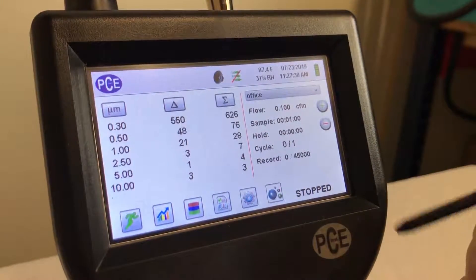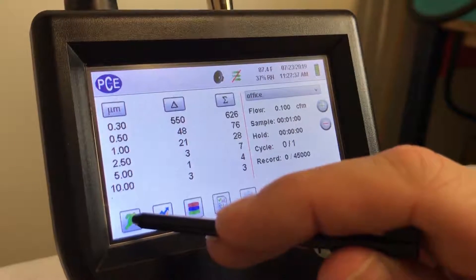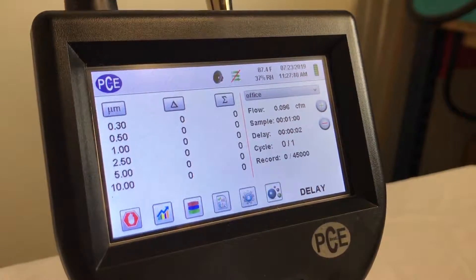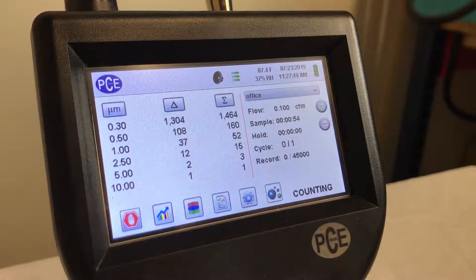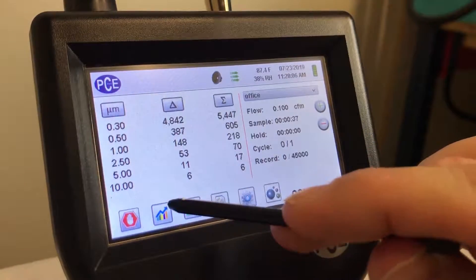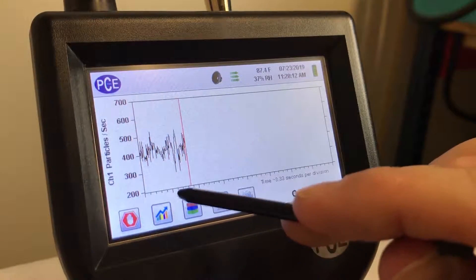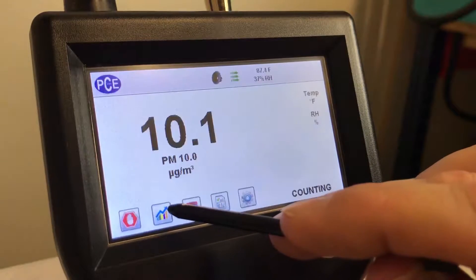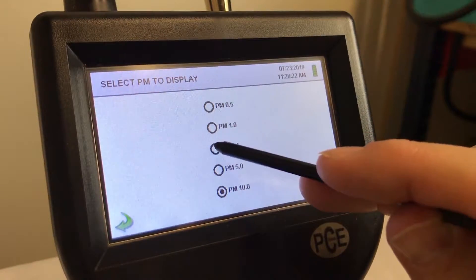So we'll go ahead and run a sample so you can see what it looks like. You just select the green running man icon to start a sample. While it's running, you can actually toggle between the screens — it's going to give you a graph. There's your PM count, that's your PM10. If you want to see something different, you can see PM2.5.